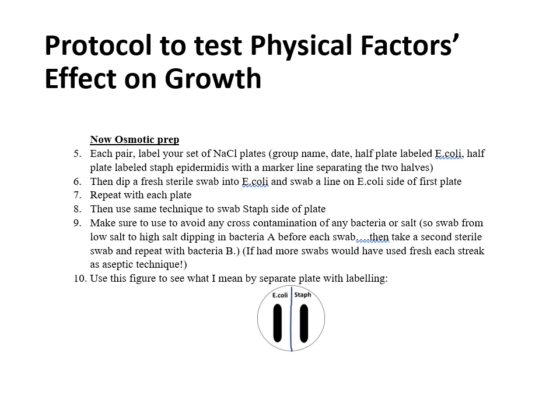Then what you do is on each of these varying salt plates, you streak both E. coli and staph, and you see which salt concentrations does the E. coli grow on, where does it end up dying off, and then look at the staph. Where is the staph able to grow on, and which plate does it end up dying off?